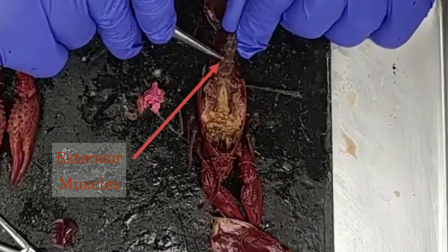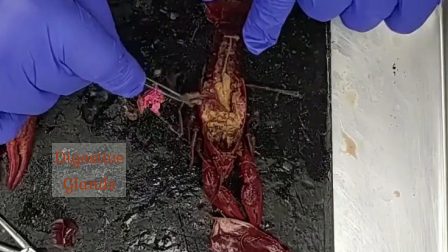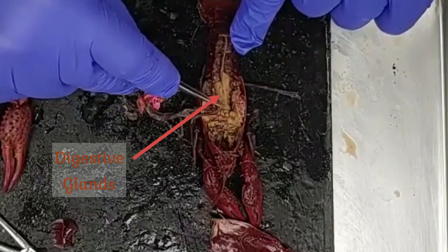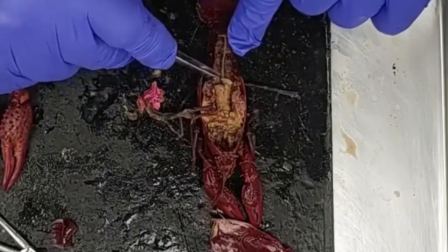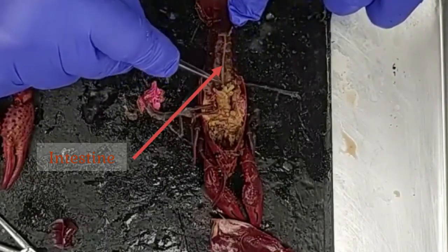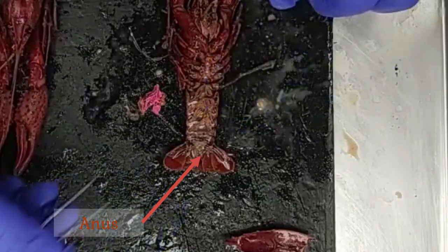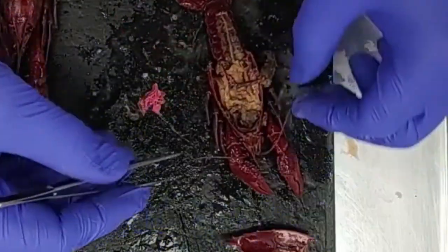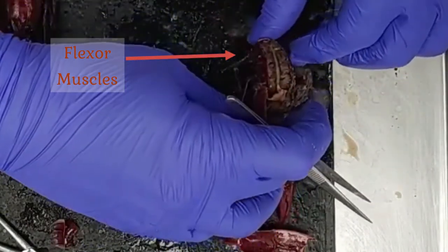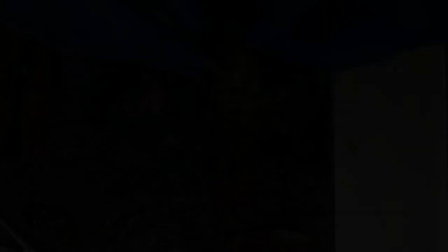Going back to our crayfish specimen, I'm going to peel back the extensor muscles. Underneath I can see the digestive glands, which produce enzymes for the digestion of food. Heading posteriorly towards the tail, we can see the intestine, which ends of course at the anus — visible when we flip the crayfish over. Going back to the dorsal side, we can see the big powerful flexor muscles around the intestine, used for folding the tail underneath — particularly important when the female is reproducing and carrying eggs or offspring.